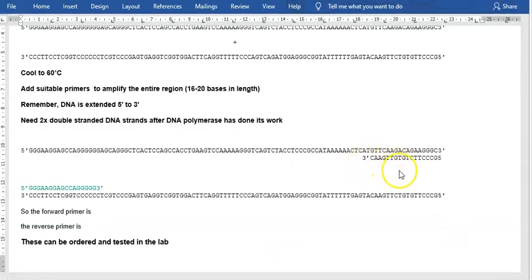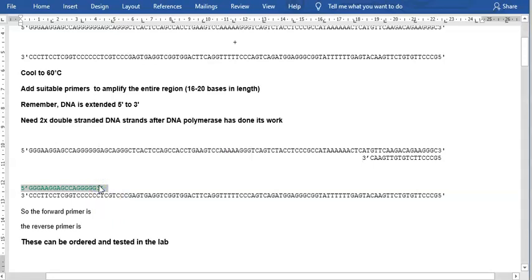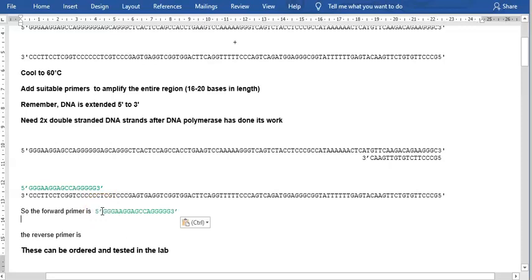Equally, you would then want to put your reverse primer up here. So it's in the opposite configuration to this one. Although all the base pairs are pairing up correctly, you'll see that this one goes 5' to 3' in that direction. This one goes 5' to 3' in this direction. So DNA polymerase will attach here and will copy along this way. All we do need to do now is write down what our actual forward primer sequence is. That's quite easy. I can just copy that and place that there.